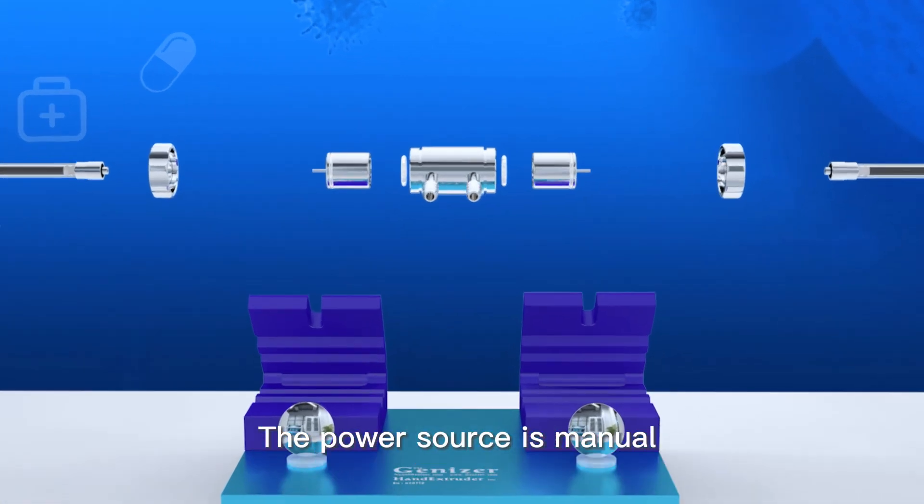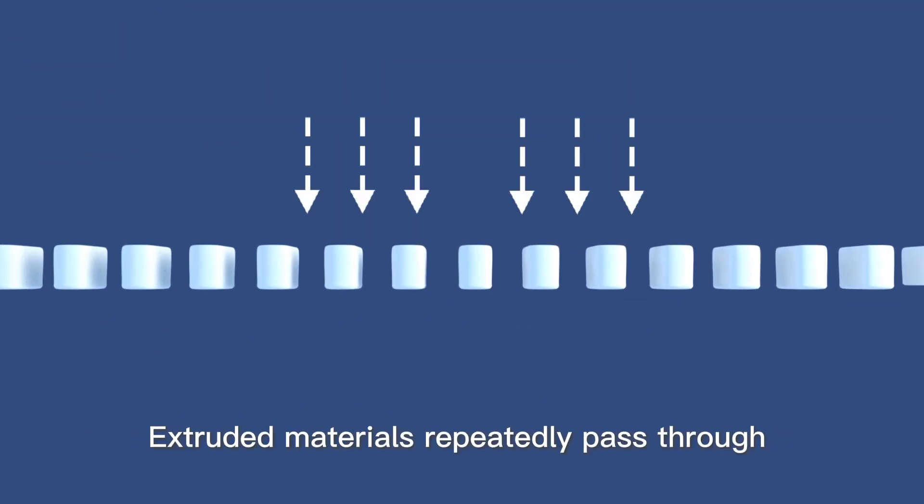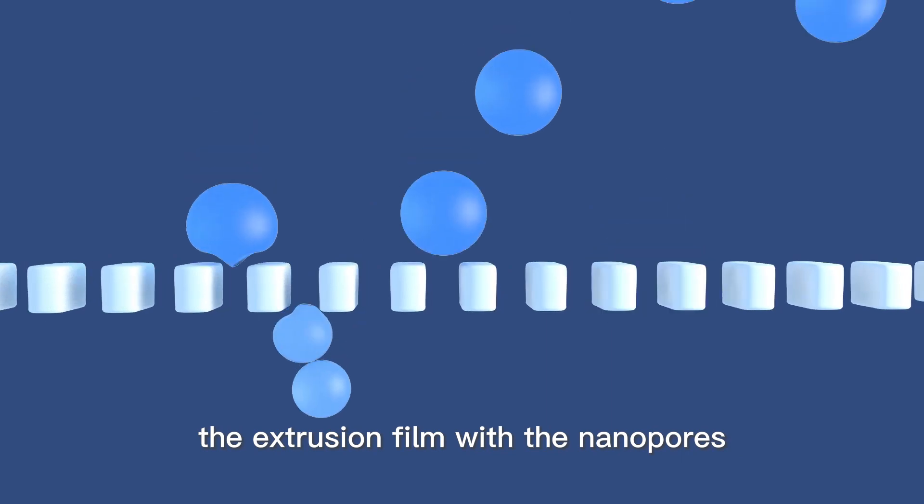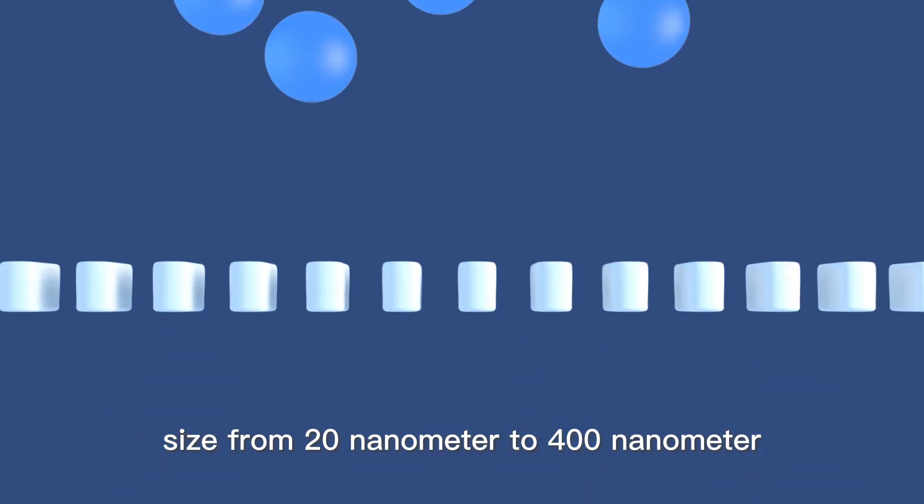The power source is manual. Generate certain pressure by pushing one side. Extruded materials repeatedly pass through the extrusion film with the nanopores. Preparation of liposomes with uniform particle size from 20 nanometer to 400 nanometer.